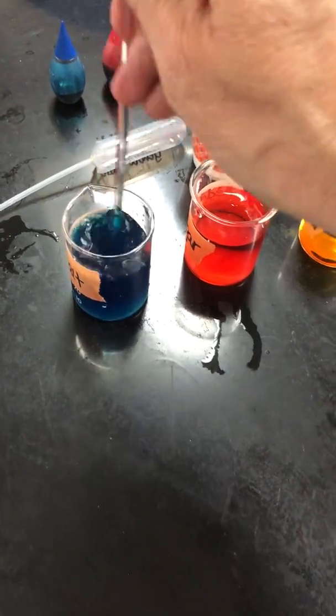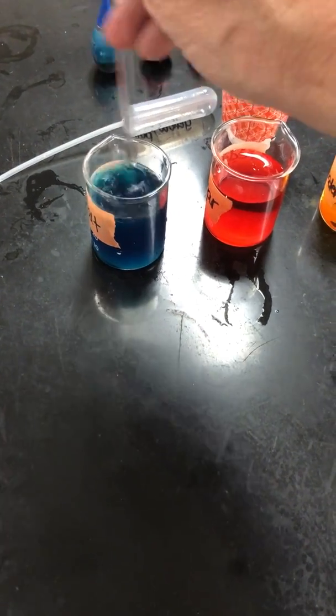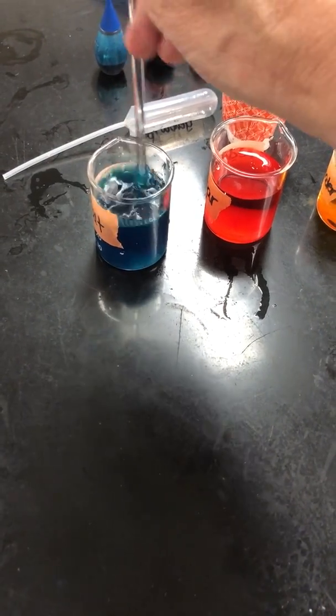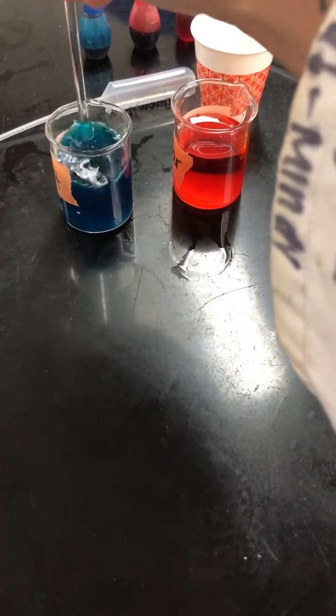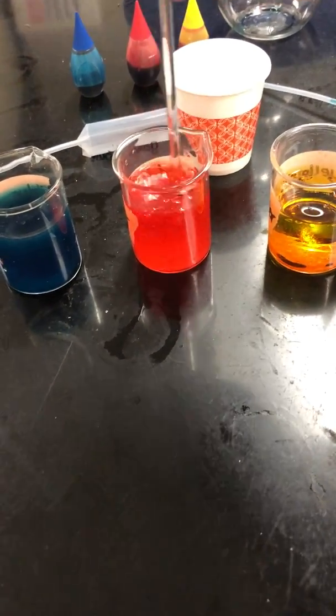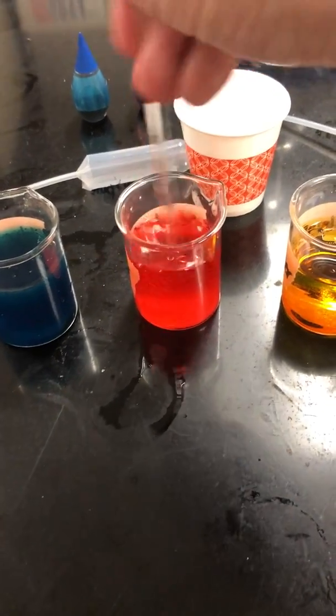And then it says take your stir rods. So stir, and honestly, it's not going to take long. And there you go. The power of water, my friends. Take a little longer, but not much. Yeah, don't be shy and loud, man. Be safe, but get in there, stir it.